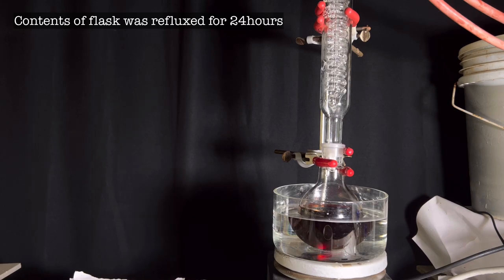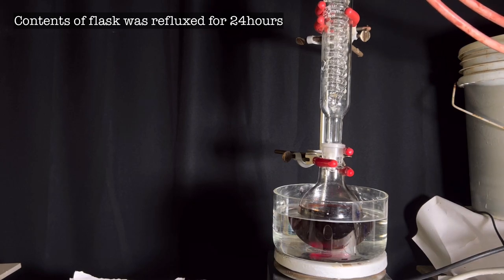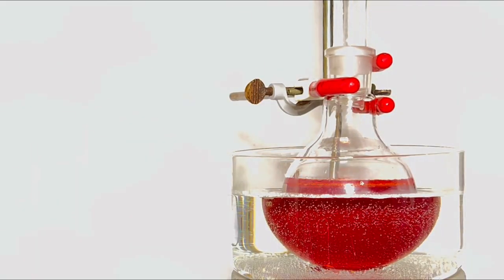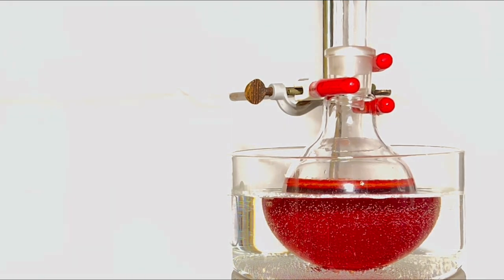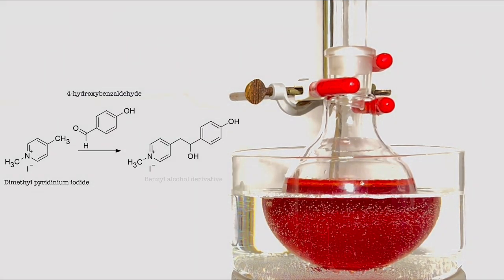The color of the contents in the round bottom flask matches with the background color making the visibility poor. So I swapped the background to a white one. Now you can appreciate the bright red color of the reaction mixture. Now we will see the second part of the reaction which is happening. Here the dimethylpyridinium iodide reacts with 4-hydroxybenzaldehyde in the presence of piperidine and ethanol to form the corresponding benzyl alcohol intermediate.